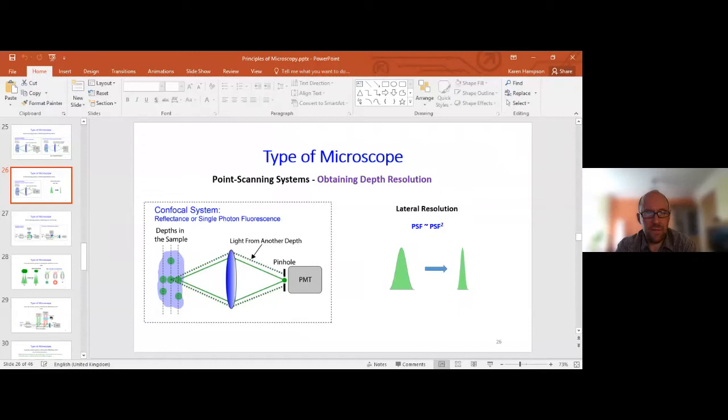However, if you take a conventional microscope, which is equivalent to removing the pinhole in the system, and you move the fluorescent layer to different positions relative to the focal plane, then you will see the same amount of light reaching the detector for every particular position. So there will be no axial sectioning or no axial response, if you like. It will just be the constant intensity for every axial position of this fluorescent layer. So in that sense, it shows very clearly the difference between axial sectioning, as we call it, in the confocal microscope, as opposed to the equivalent wide field or conventional microscope.